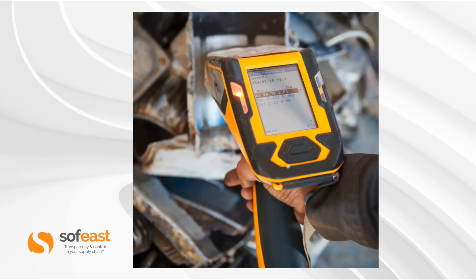We can see a typical in-field use here where an inspector is checking the composition of a product — this looks like a scrapyard — working on material being collected.